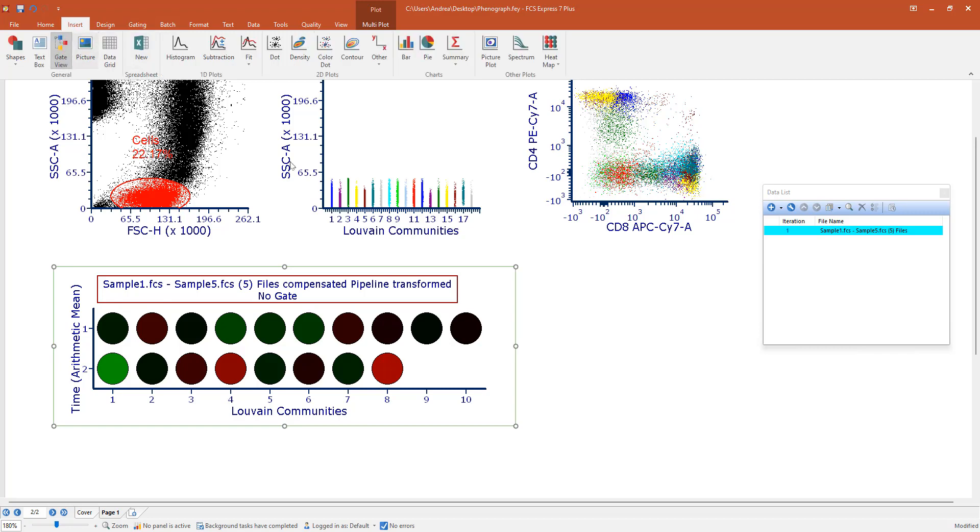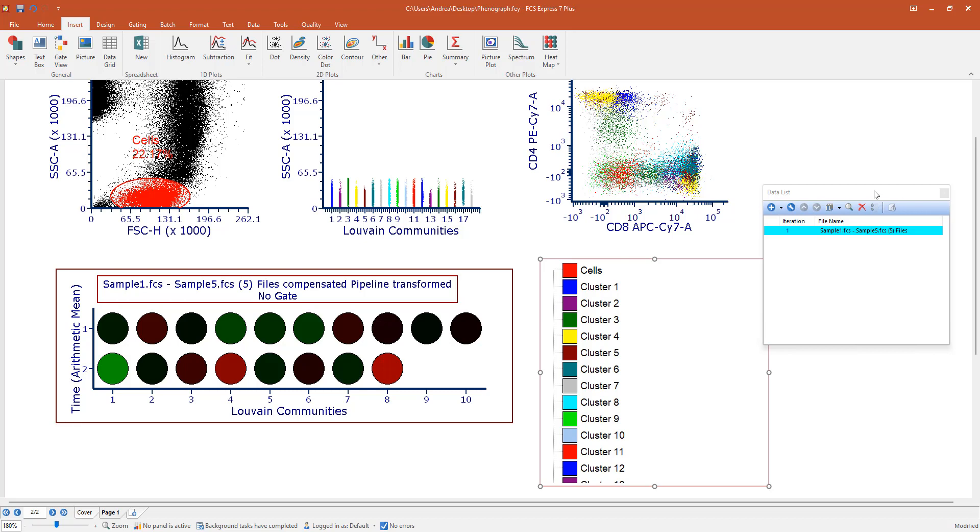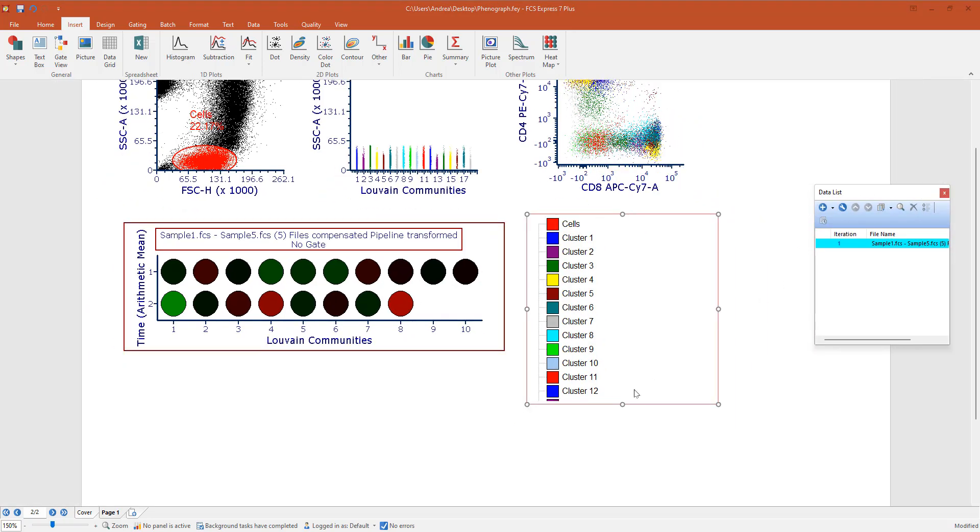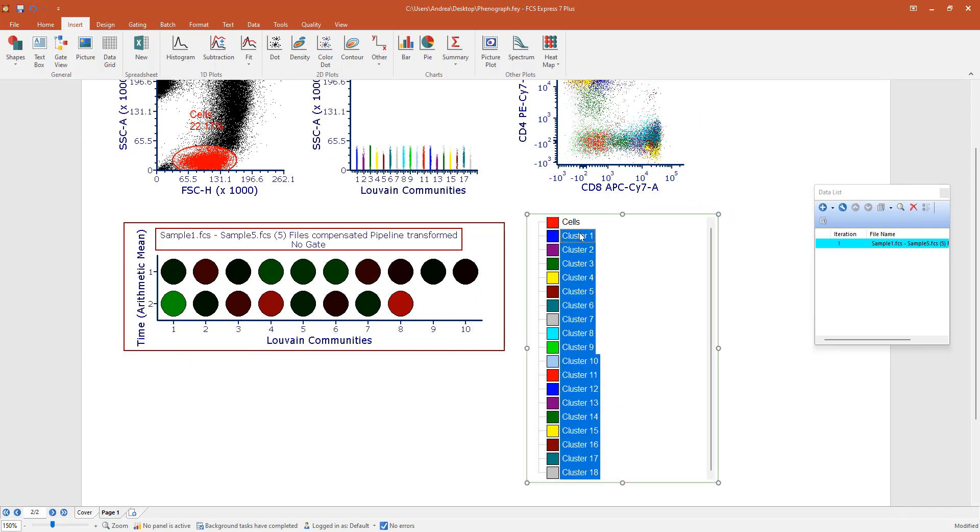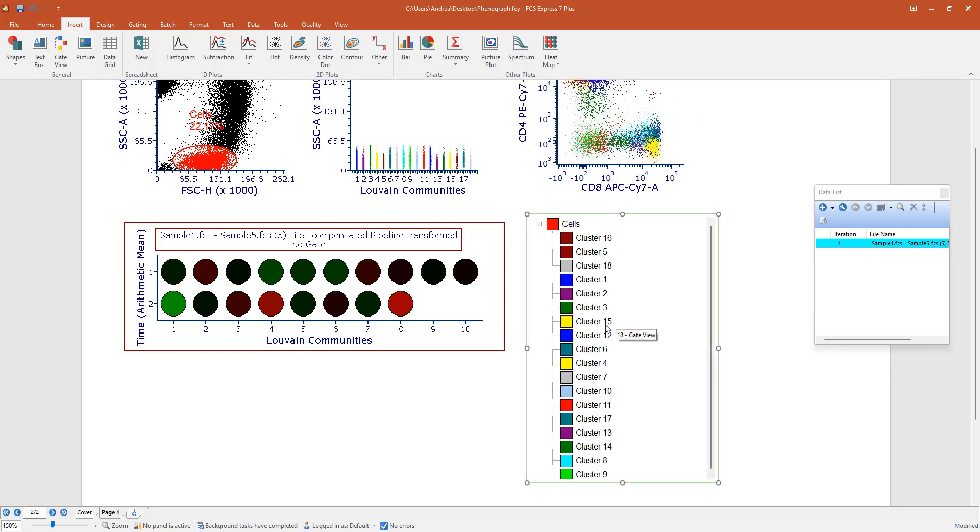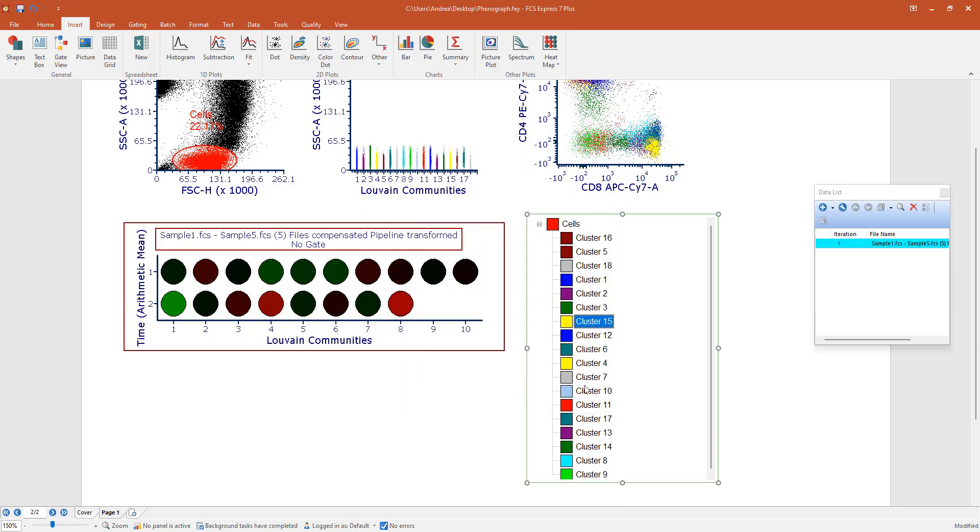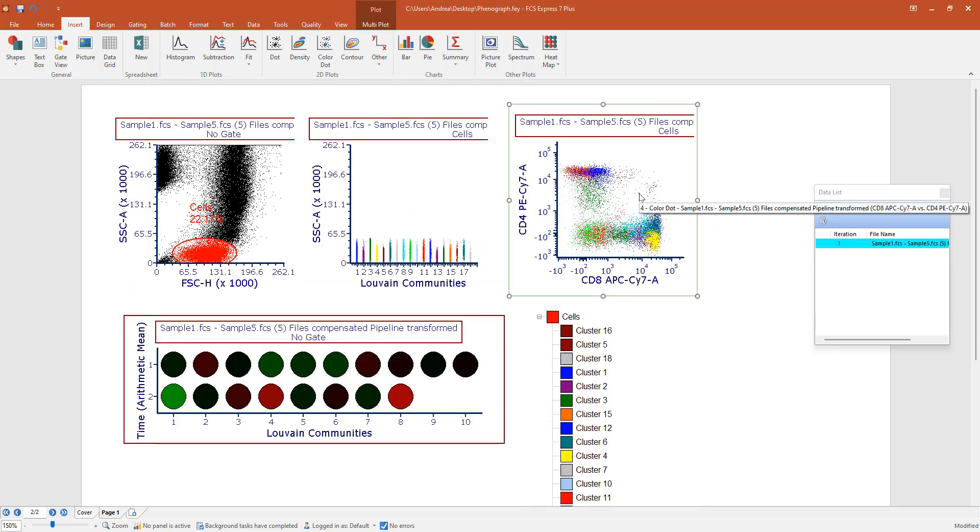If you open the gate view you can work with those cluster gates as you usually do with any other gate in FCS Express. So for example I can change the hierarchy by moving them under cells. I can double click on a cluster gate to change the name or to change the color. And here you see you have a very quick way to backgate every single cluster in a color plot.